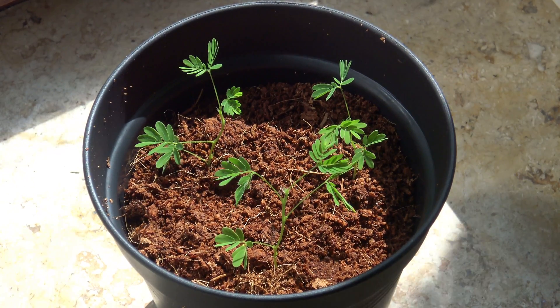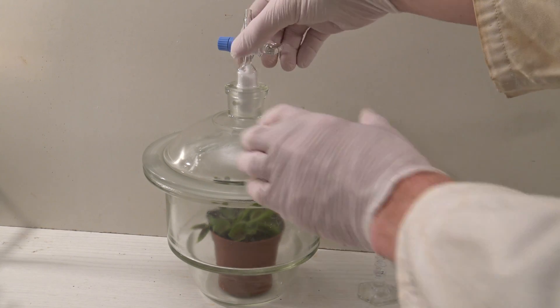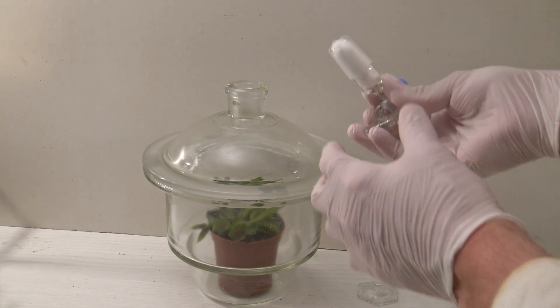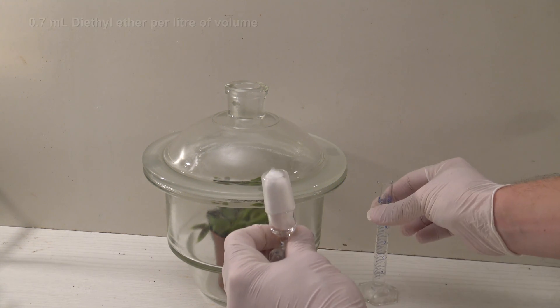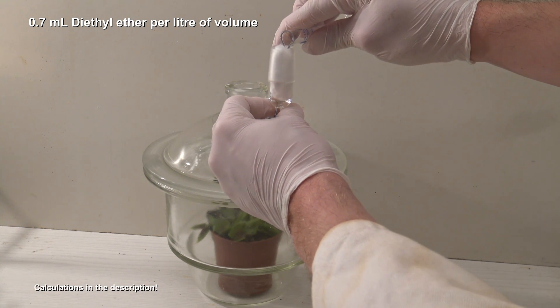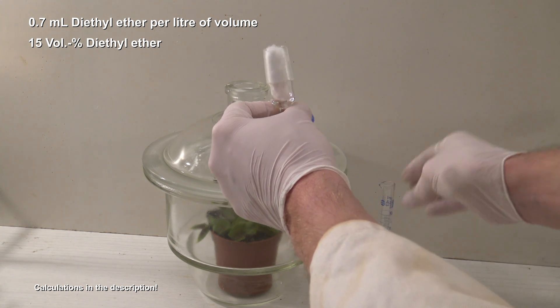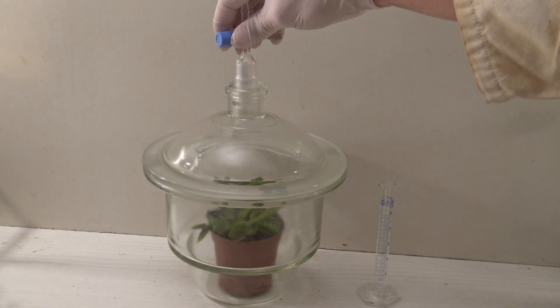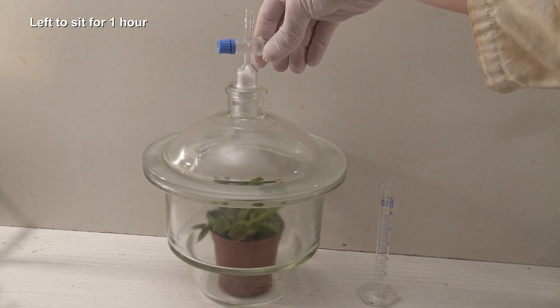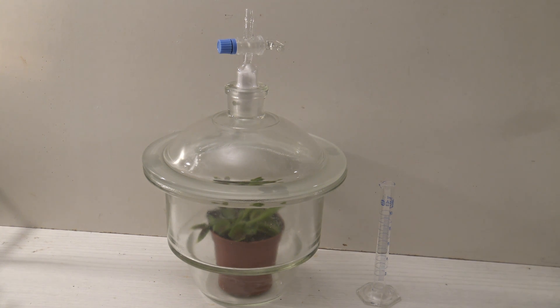The setup is somewhat simple. As a container, a large desiccator was used. In the stopper, some cotton wool was placed that can be soaked with ether. 0.7 ml of diethyl ether were added per liter of volume, leading to a concentration of about 15% ether in the air, which shouldn't be harmful to the plant. The container was then closed and left to sit for one hour to let the ether spread well in the chamber. The stopper should be sitting loosely because of a small buildup of pressure.